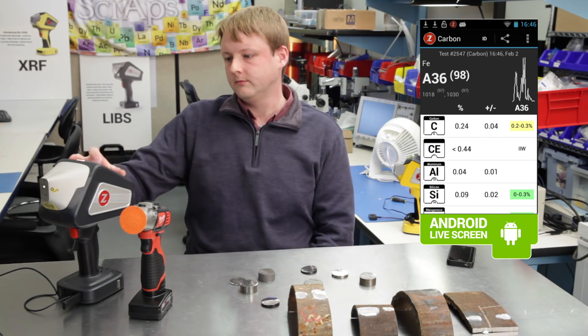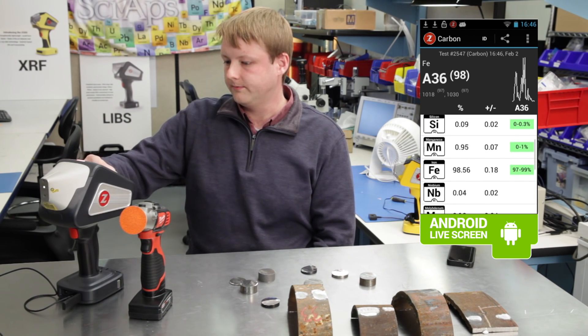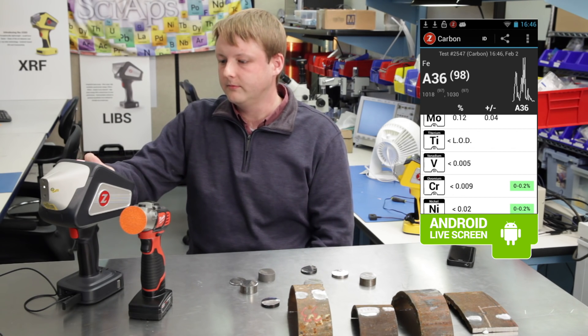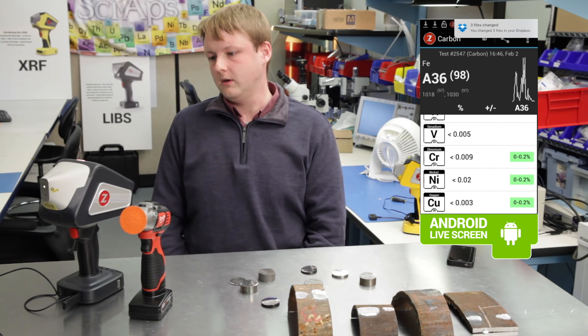The carbon equivalence is showing a less-than sign — that's because of really low vanadium that wasn't detected. Low chrome as well, and low nickel and copper too.